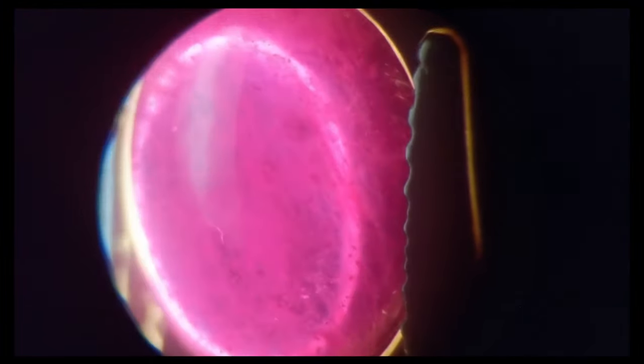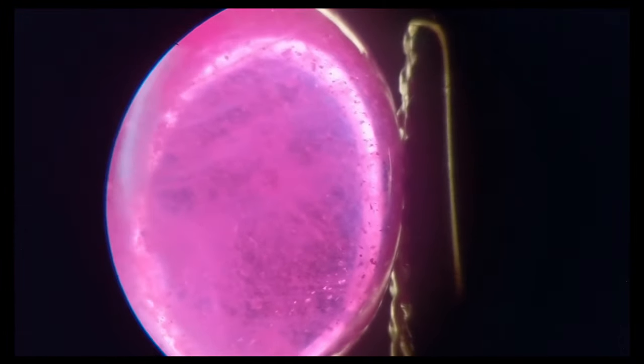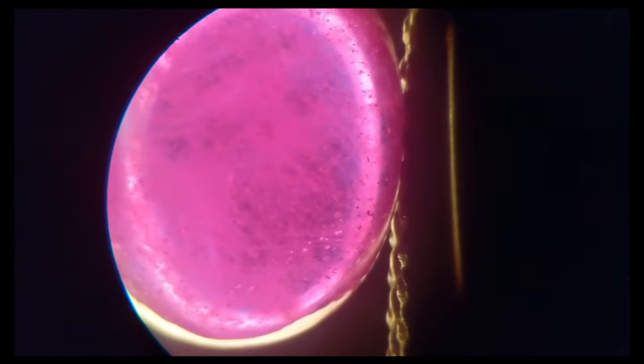Gas bubbles can also be seen in glass filled rubies as you might have noticed from the other microscope videos which I showed you. But in this one you will notice there's no inclusion which is reaching the surface of the stone. I'm just zooming out in the second microscope video which you can see here. And so when there's no surface indicator cracks so you could know that this stone is actually has been crystal has been made from the synthetic process which causes these a lot of these gas bubbles around.